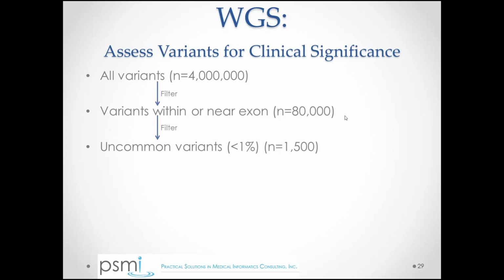Now, again, we're suspecting that this person has a private mutation, and we're suspecting that he has a private mutation in the LDLR gene. And so we can go to public databases. There's one called the 1,000 Genomes Project, and then there's another one called the ExAC Project, where they've done either SNP-based testing or whole genome sequencing on lots of people, thousands of people, and they publish all of the allele frequencies and the SNP frequencies and the variant frequencies.